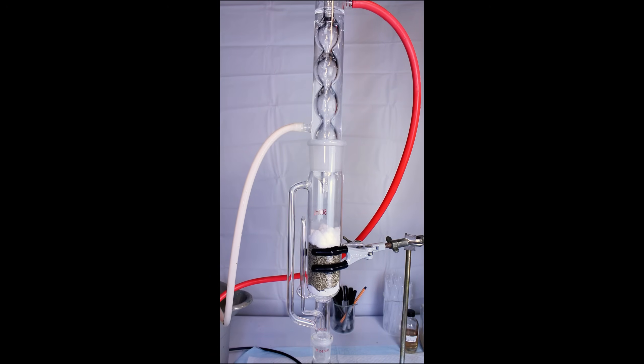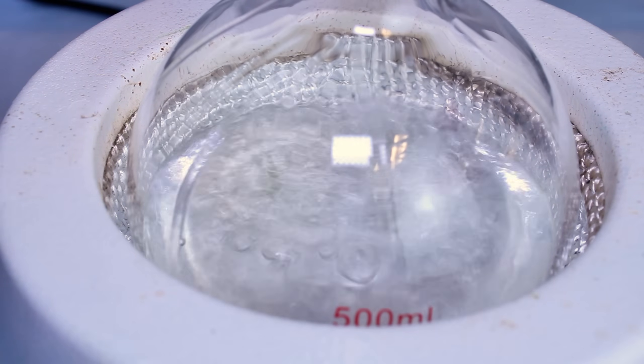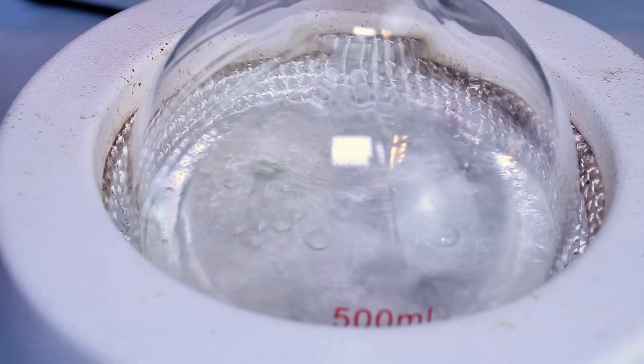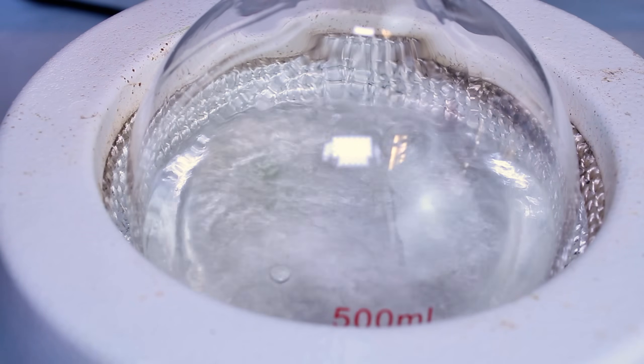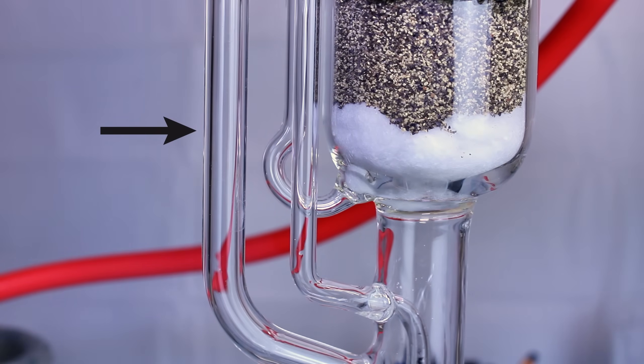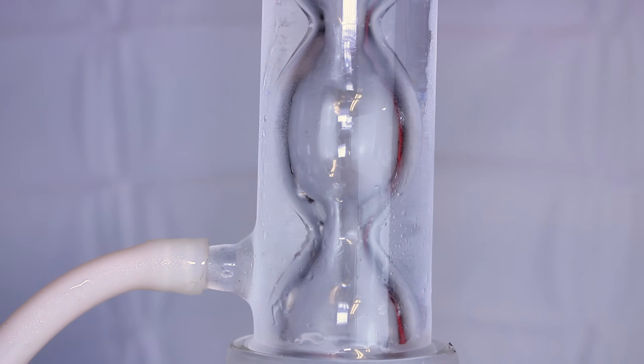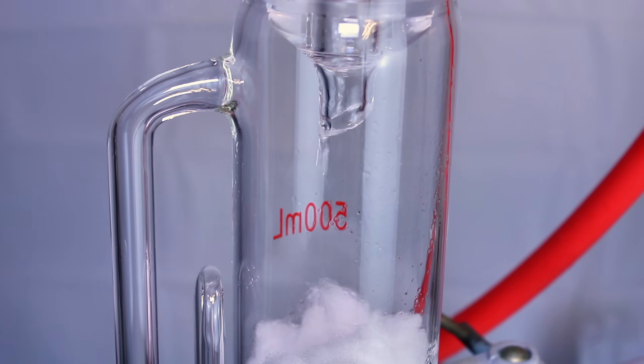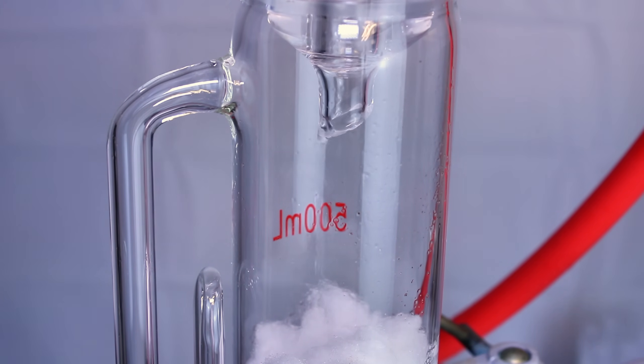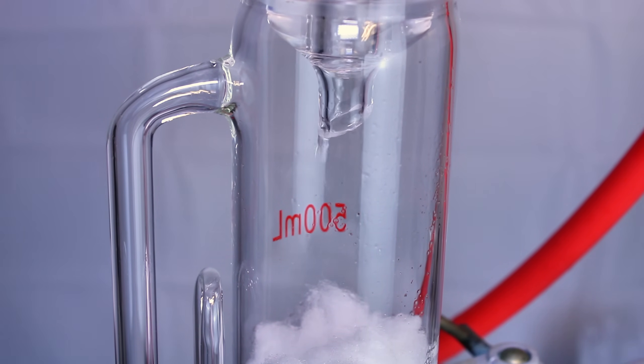Cold water is circulated through the Allihn condenser, and I crank my heating mantle to 100 degrees Celsius. As the isopropyl evaporates, it travels up the leftmost arm of the Soxhlet Extractor and back up into the condenser, where it's immediately condensed back into a liquid and drips onto the black pepper. Over time, the solvent soaks through the pepper and pulls out the piperine along with several other secondary chemicals.